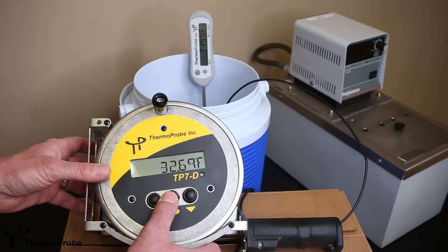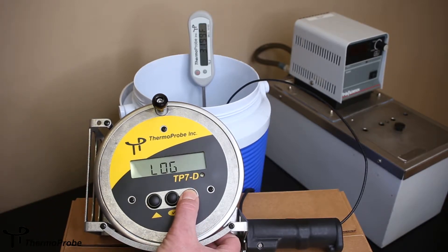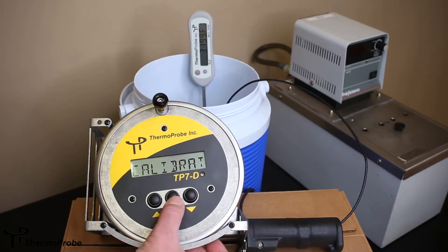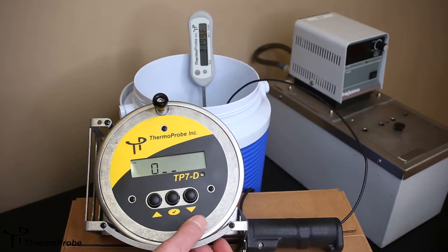To get the instrument into calibration mode, browse to the calibration selection in the software using the up or down arrows until it gets to calibrated. Use select to enter calibration mode.